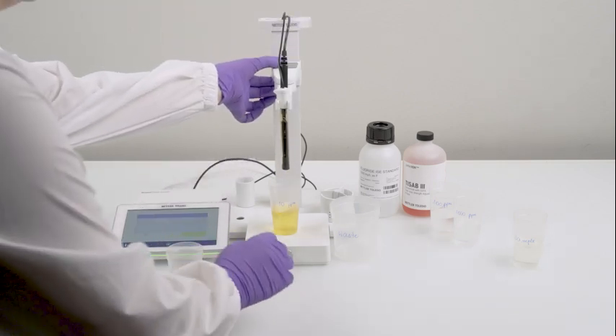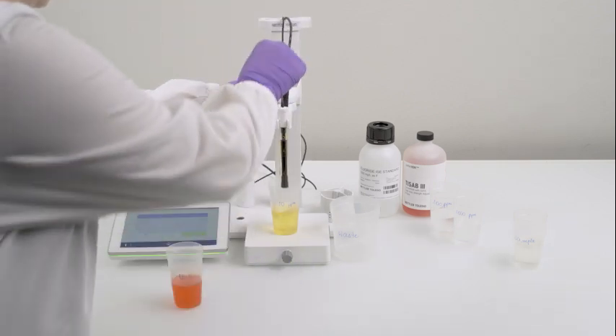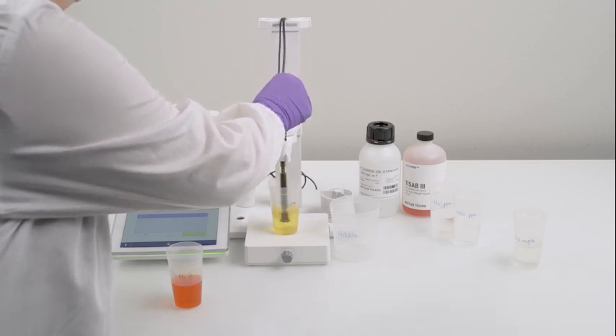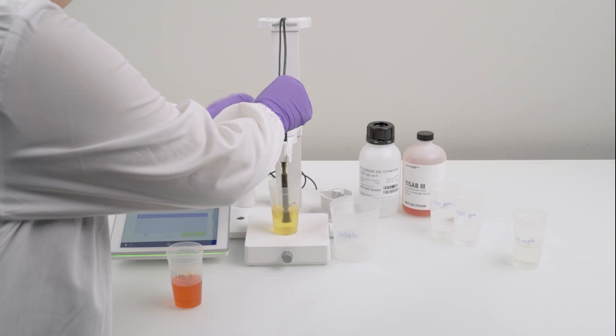Now let's move on to calibration. Start by dipping the sensor properly into a 10 ppm solution. Always choose standards that bracket the sample's concentration range and increment by 10-fold concentrations — for example, 10 ppm, 100 ppm, 1000 ppm.